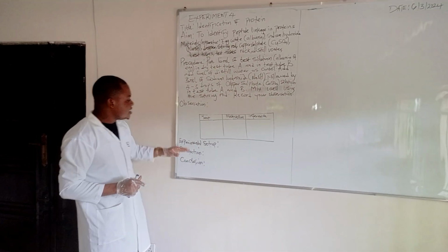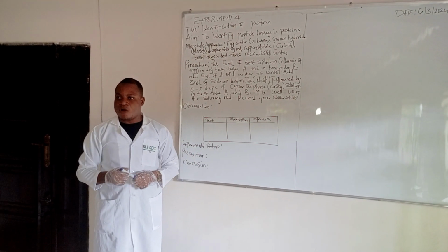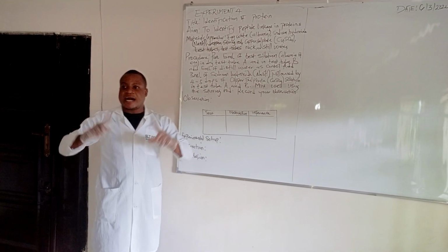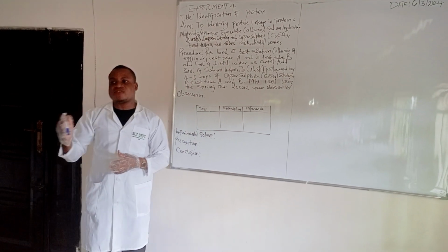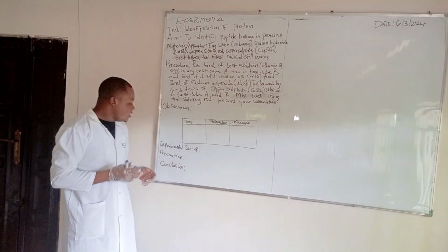Now, the next thing is your experimental setup. The experimental setup, we'll look at that in our workbench. I've told you it is the diagrams or the setup you use in carrying out the experiment. That's what we call the experimental setup.